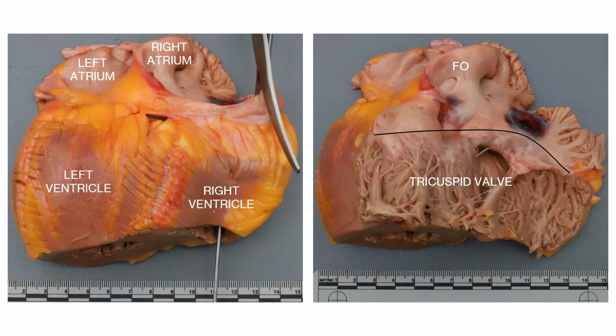Okay, so getting into that, remember we opened our IVC into our right atrium, starting at the lateral aspect or the posterior aspect we're looking at. You can see my scissors heading down that lateral posterior part. We're going from the right atrium into the right ventricle. I always recommend, until you get comfortable, probing your cut path. So you see my scissors heading from the right atrium into that right ventricle, which will expose our tricuspid valve.